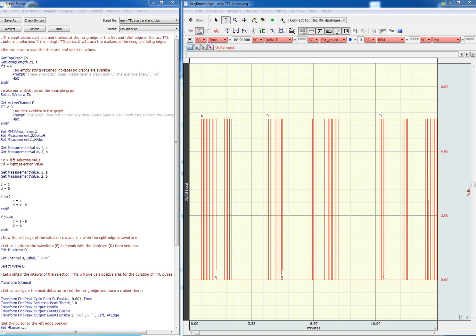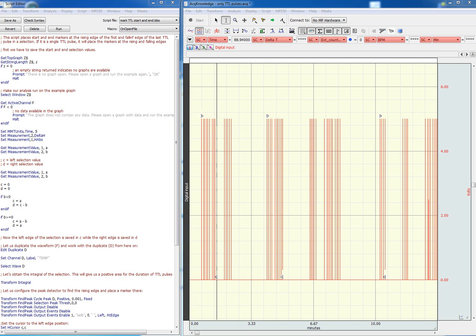A further modification of the script allows us to place the end marker a few seconds after the last TTL pulse, so we can take meaningful physiological measurements after the last TTL marker as well.